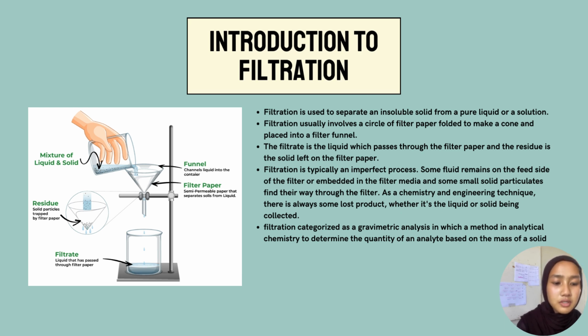Some fluid remains on the feed side of the filter or embedded in the filter media, and some small solid particulates find their way through the filter. As a chemistry and engineering technique, there is always some lost product, whether it's the liquid or solid being collected. Filtration is categorized as a gravimetric analysis, a method in analytical chemistry to determine the quantity of an analyte based on the mass of a solid.